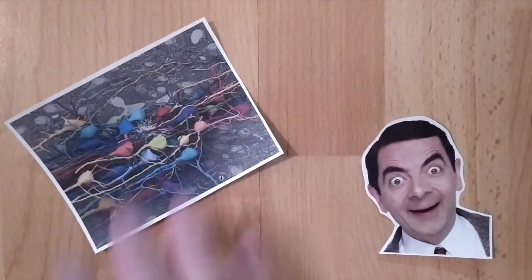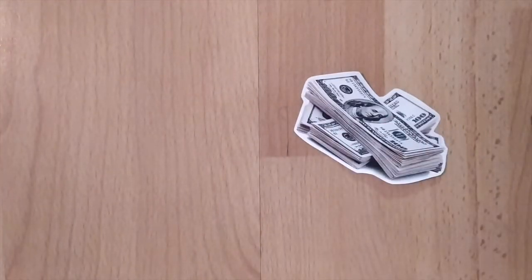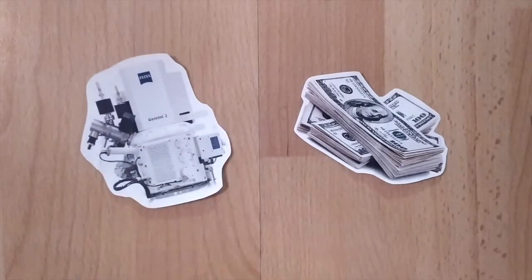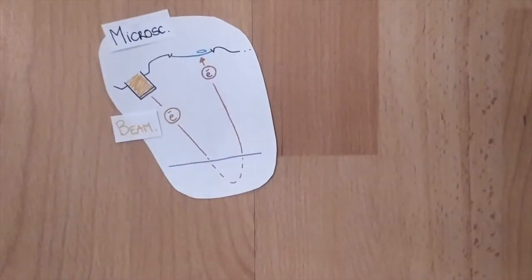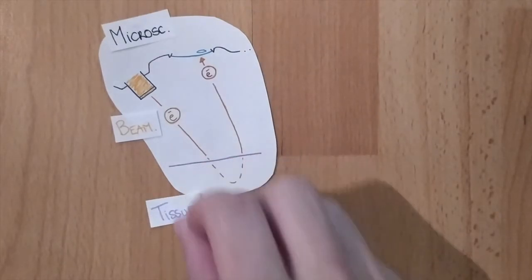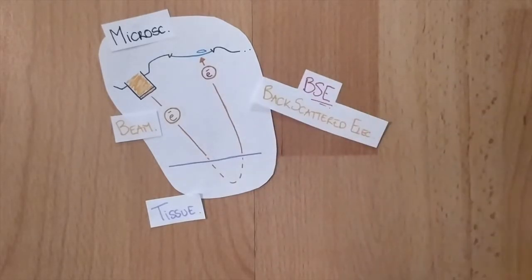I know, it's exciting. And you want to know something even more exciting? We can do awesome 3D reconstruction of synapses in our case. But the awesomeness has a price. In fact, all of those acquisitions will be produced thanks to a combined FIB-SEM microscope, basically a very expensive microscope. Built to emit an electron beam, those electrons can interact with atoms that compose the tissue and get back to the microscope to produce this type of image. This is what we call BSE, backscattered electrons.